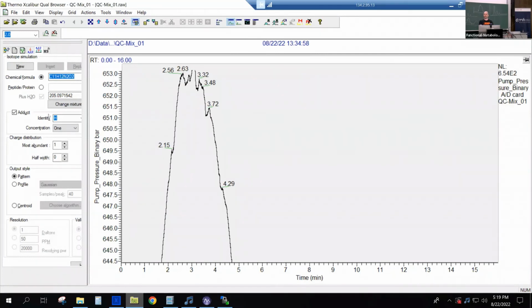Well, we have very diverse samples in the lab, from all sorts of things, and sometimes people just bring something that has a lot of PEG or whatever, and then you ruin your column, and it's better if you ruin only your pre-column. That one has a cartridge holder and you can exchange it. So basically most of the columns we have have pre-columns.